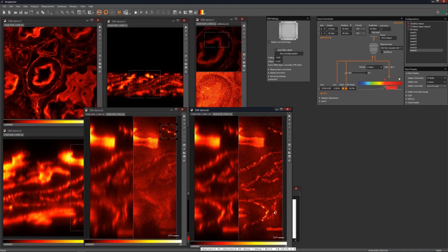And in this sample we were looking at kidney tissue mounted in Abberior Mount Liquid, and we were using a water objective, and we could maintain good resolution all the way through this tissue slice. But we've done lots of different samples before, and I will show you a few different combinations going back to the presentation.